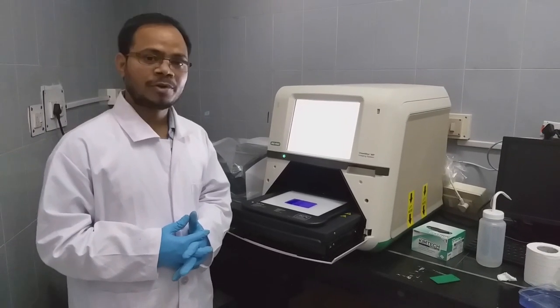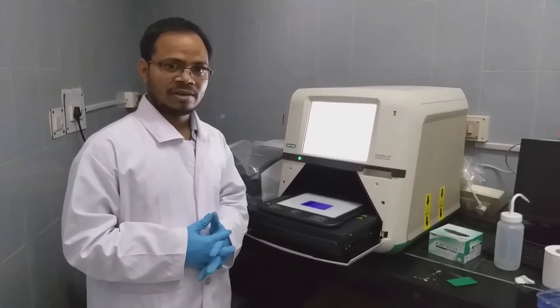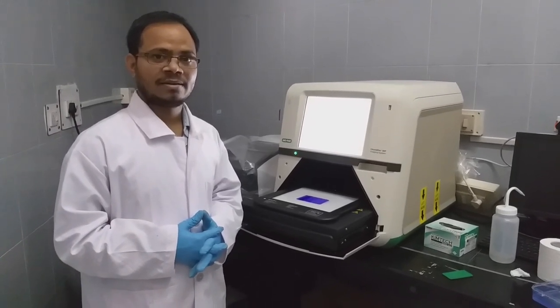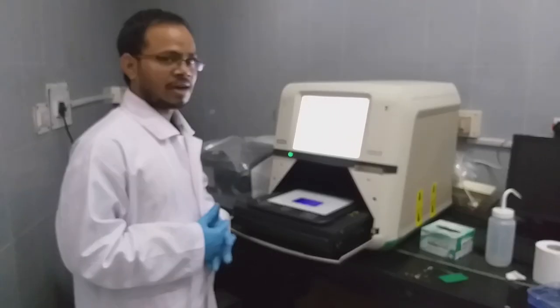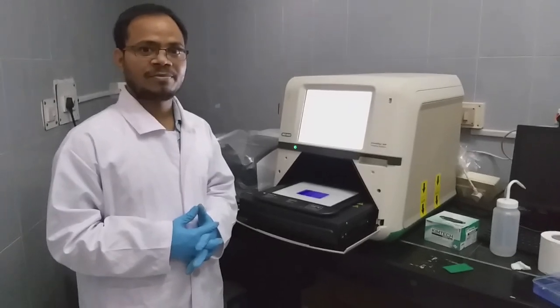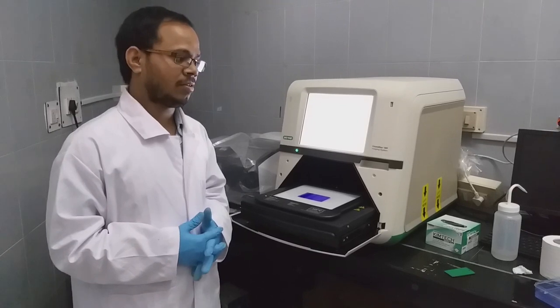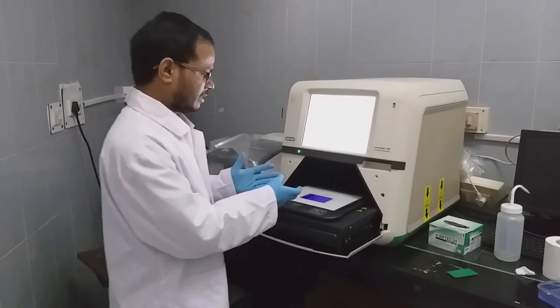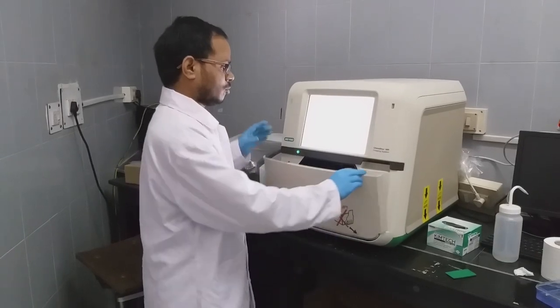So we purified the protein using a nickel NTA column. We ran the gel and stained and destained it. So now it's time to document the gel. We have to identify whether we got any single band fraction or not. So this is the gel I kept on a white tray. Now just close it.